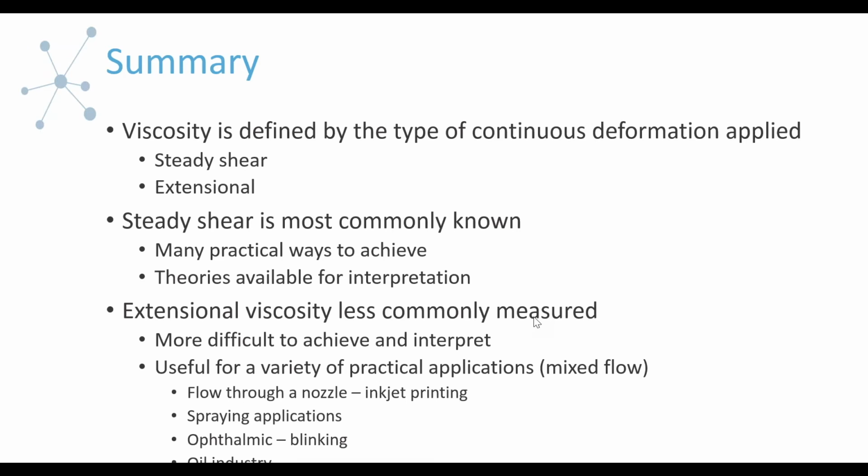We also have a question about, can we measure polymer melts? That really depends on the exact system. Obviously certain polymers will flow at lower temperatures than others. Okay, so you're talking about a PET blend. I don't know the exact transition temperatures for that, but you would have to be able to load the sample into a syringe, which then would be pumped through the flow channel. So if you can load it at a temperature where this is possible, then yes, you could do melts.